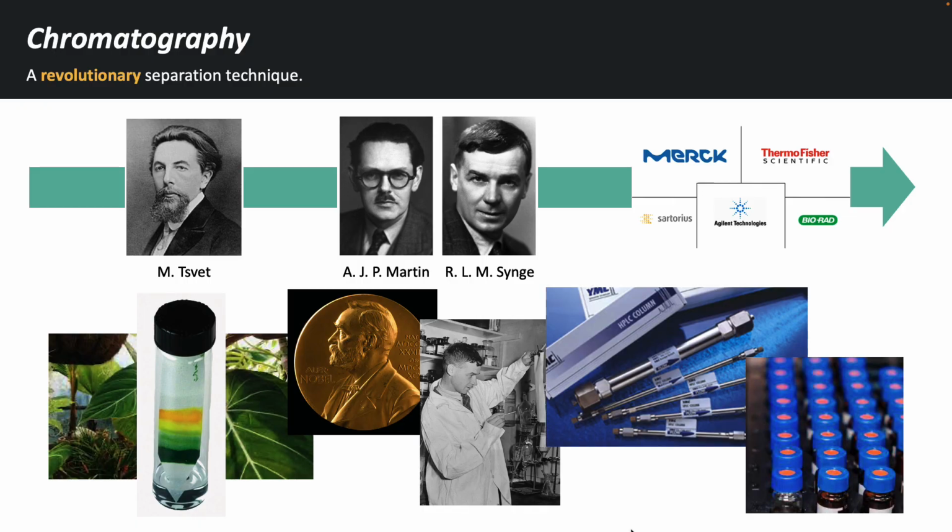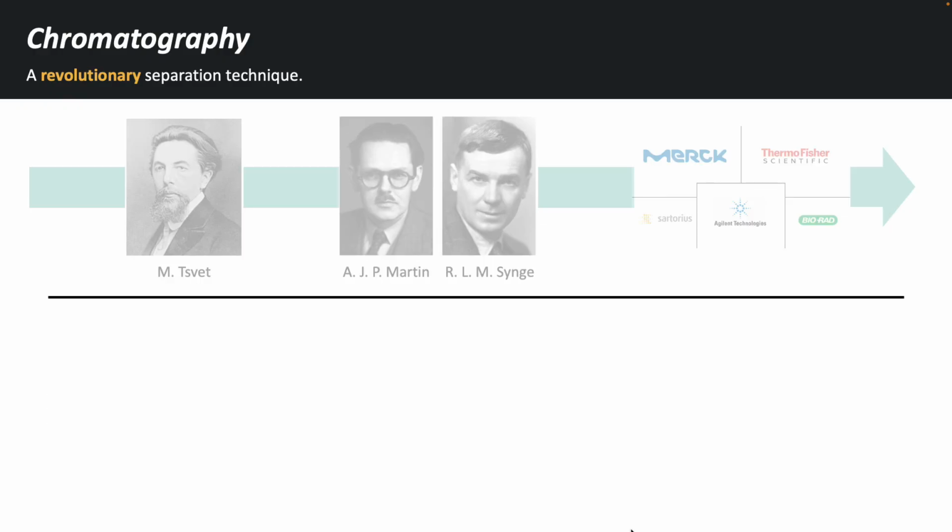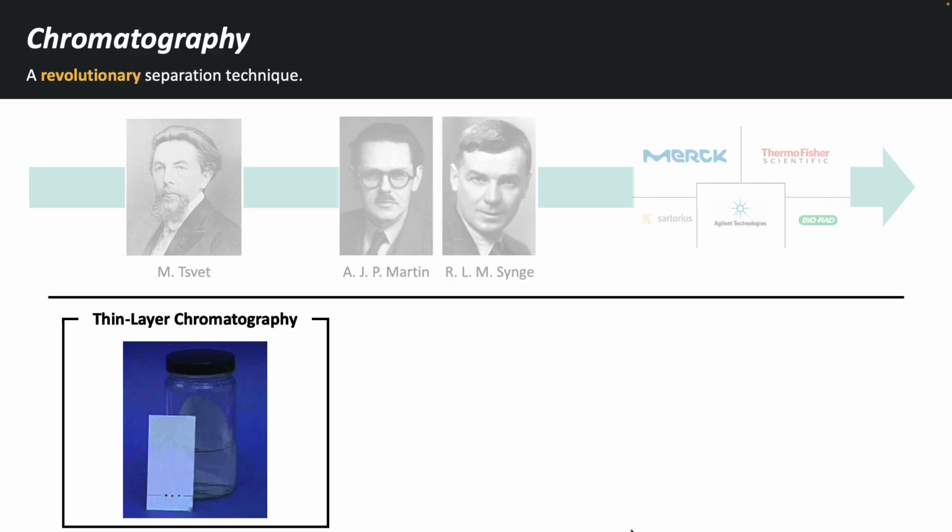This is an incredibly powerful technique for synthetic organic chemists and is one of the most common methods that we will use this semester and that you will see in any chemistry-based research. Specifically, we will be looking at thin layer chromatography.